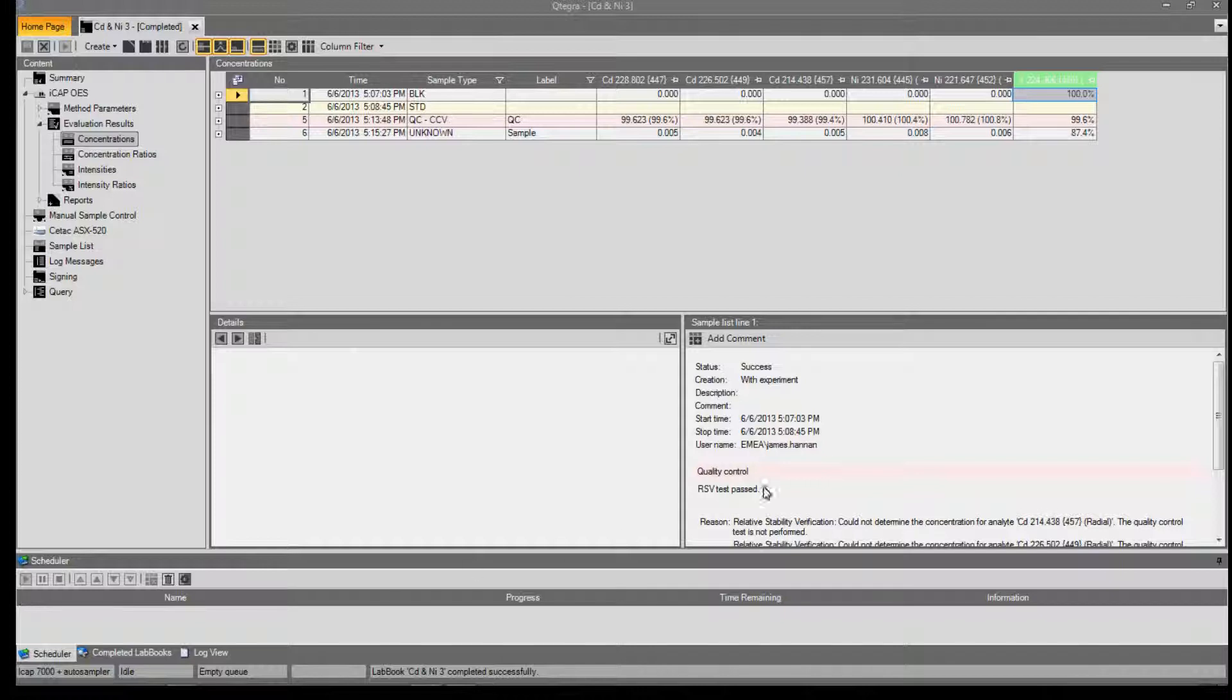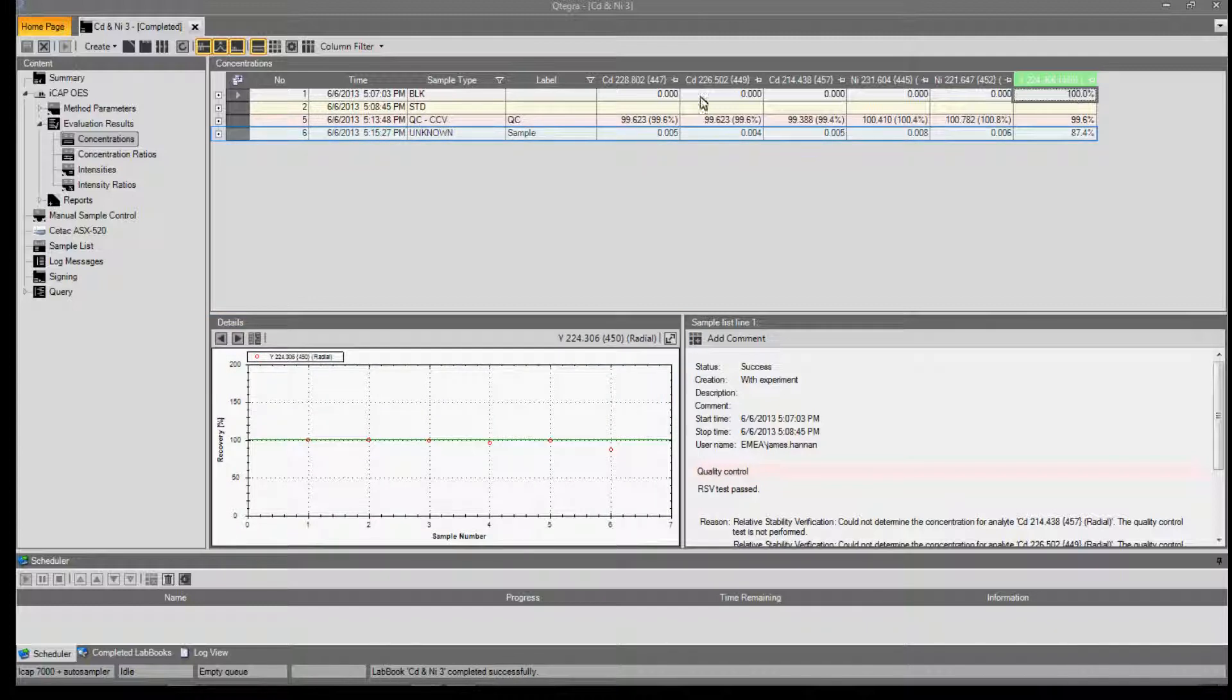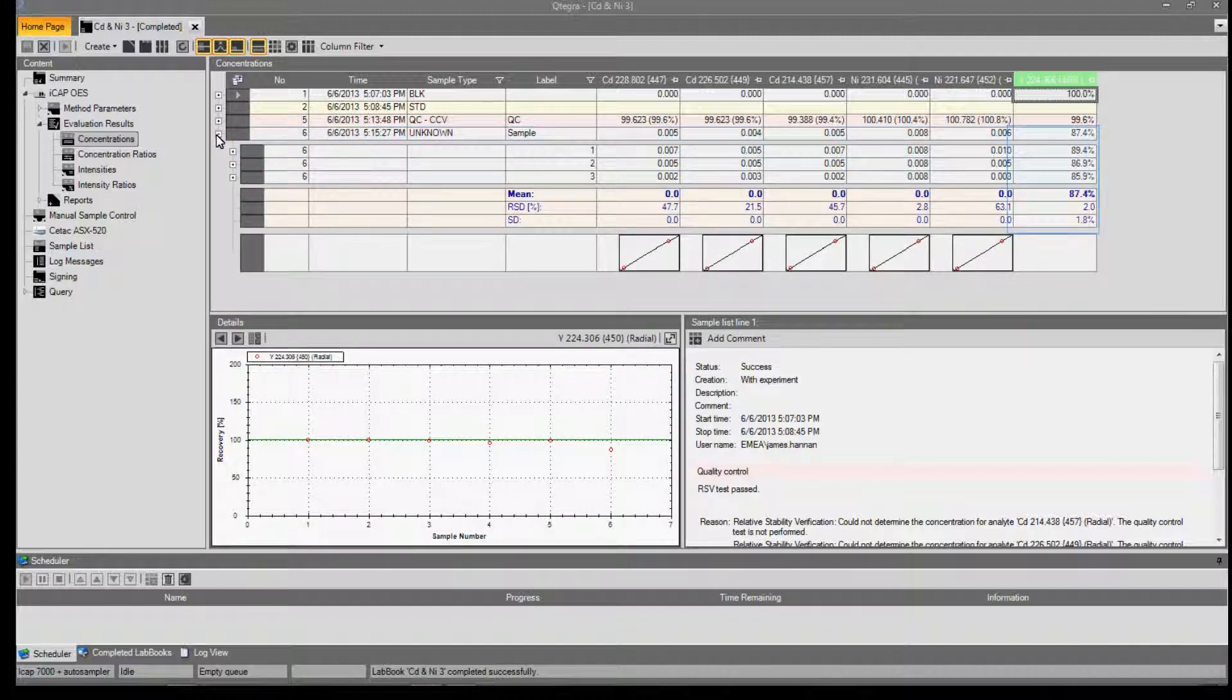Once our analysis is complete, we can select one of the results to view the stability over time. Alternatively, we can open up one of the samples to gain information about the repeats.